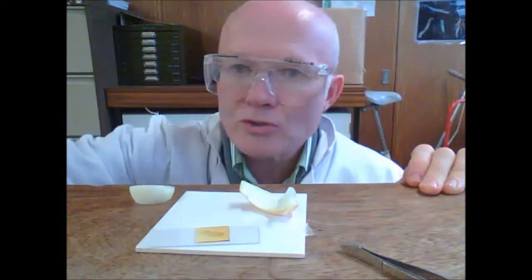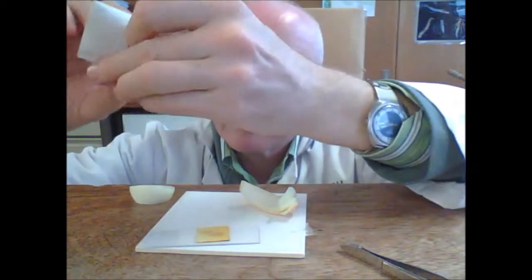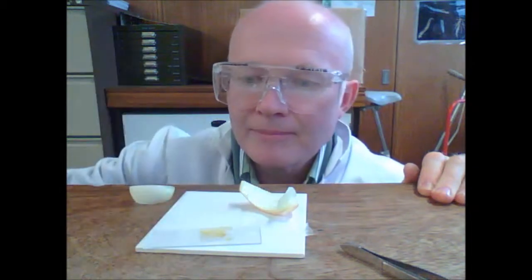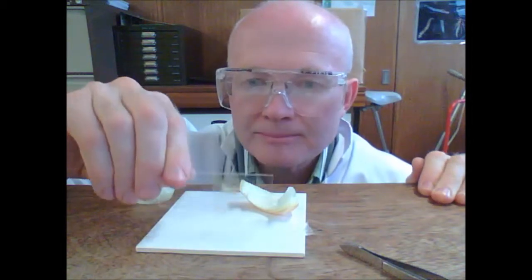Then you can blot dry with a bit of tissue. Just take a pad of that and blot it dry. The slide is now ready for examination under the microscope.